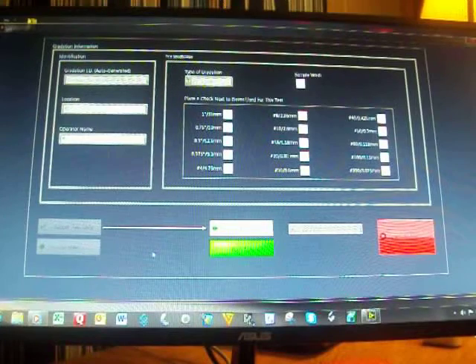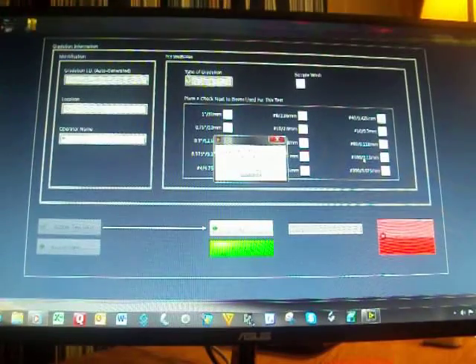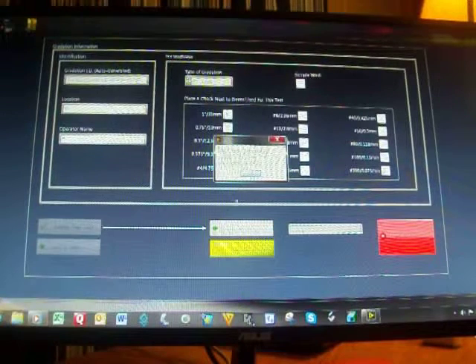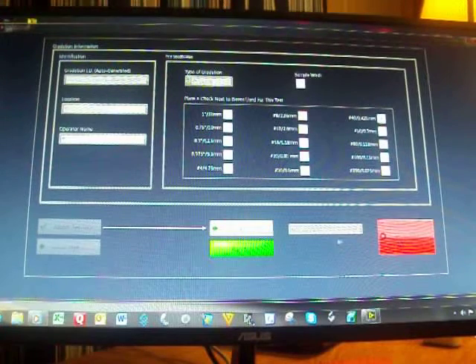When it's done with that, it's going to give us another dialog. It's going to ask us to load our sample. That'll be coming up as soon as it finishes reading the initial 15. Okay, so we're prompted here to go ahead and load our samples into the chamber. When we're done, we click OK. And at any time during this test, we can abort if we want to.